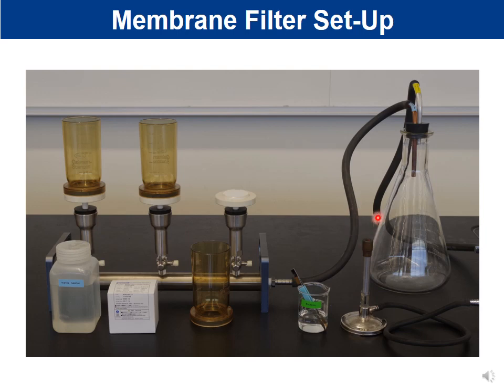Now, when you flame sterilize them, because they're dipped in alcohol, when I put it in the flame, the tweezers are going to momentarily catch on fire. And that's normal. You wouldn't panic when you saw that. You would just have to wait. Once you flame your tweezers, you would need to let them cool before you touch the nitrocellulose.